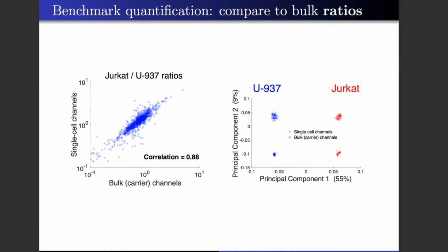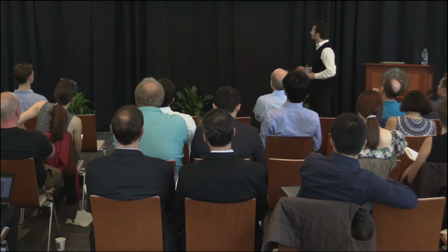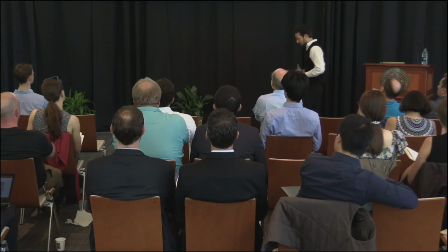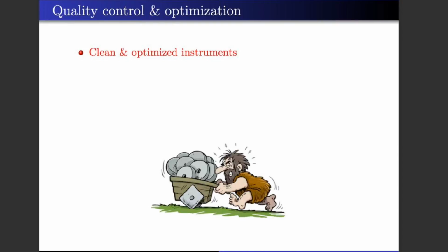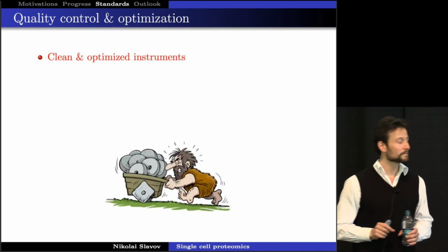That's me. For more than a year, I have been doing this. Now, I told you that experiments can be rather variable. There are lots of ions all around us. If I just cough, I coughed a minute ago, I spew up way more ions than all the single cells that Harrison has prepared this week. And that's a problem because all of that causes trouble.